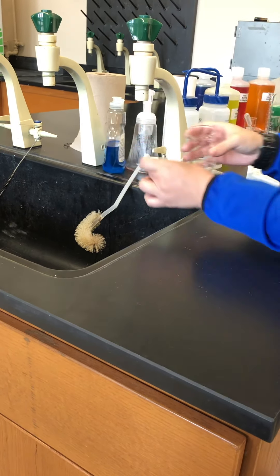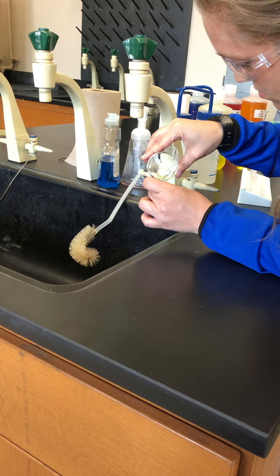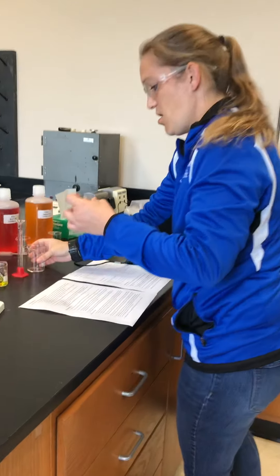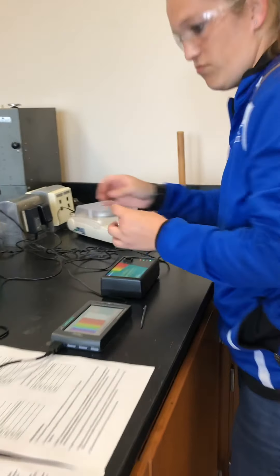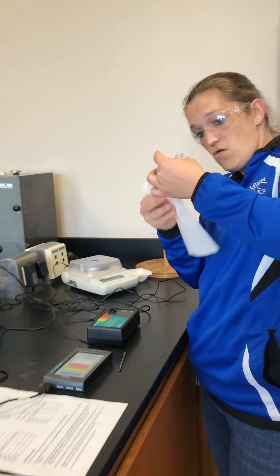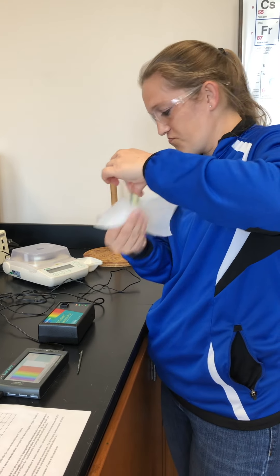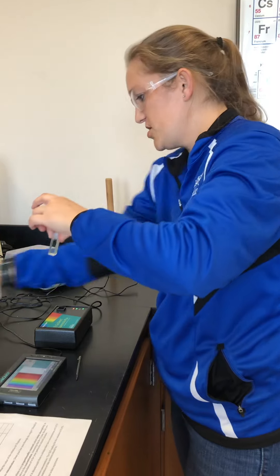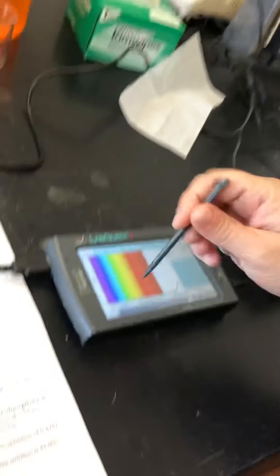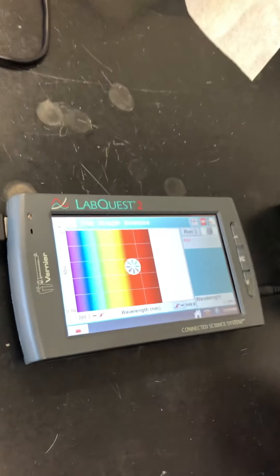Rinse, and then the last one. Fill it up — good amount there. Almost forgot — no air bubbles. It would have been okay, but you never know. Better safe than sorry. Tap it in, tap my graph, let it run.